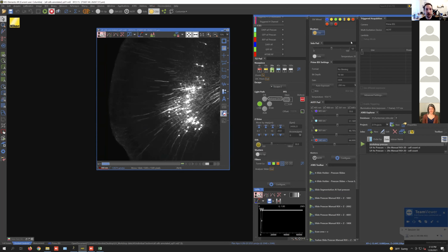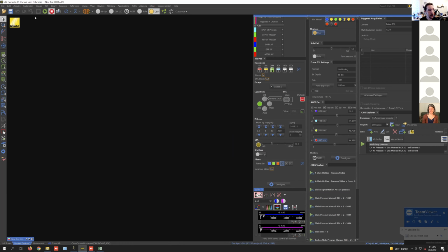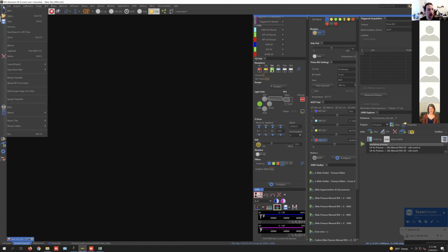And importantly, you need to have all those images into one data set before you start training the masks and then training the network. And the way that you could do that is if you have a variety of images. Let me just show you a good way to do this. You can go to File, Import, and then create an ND file from a file sequence.